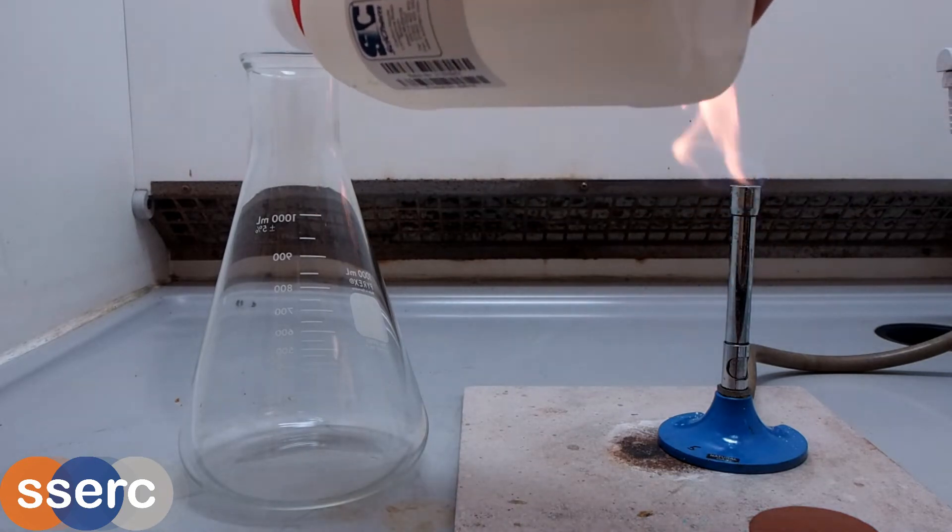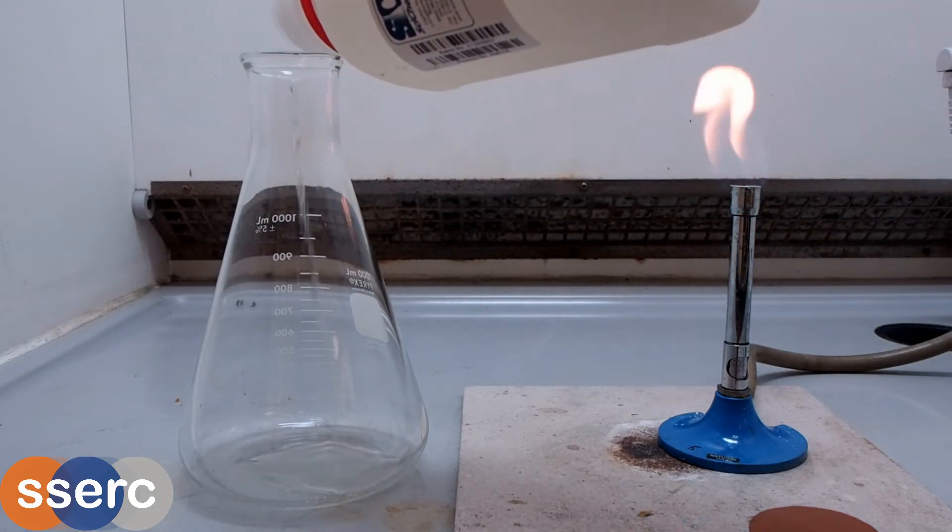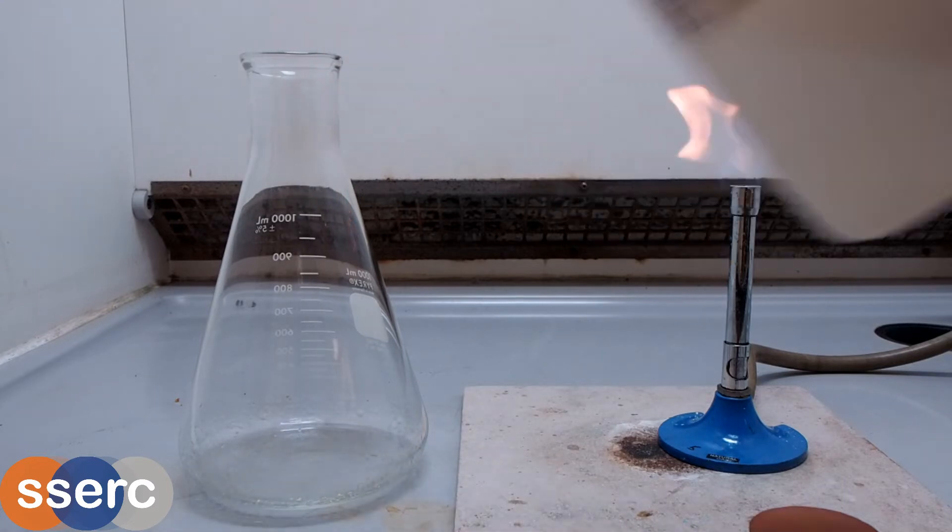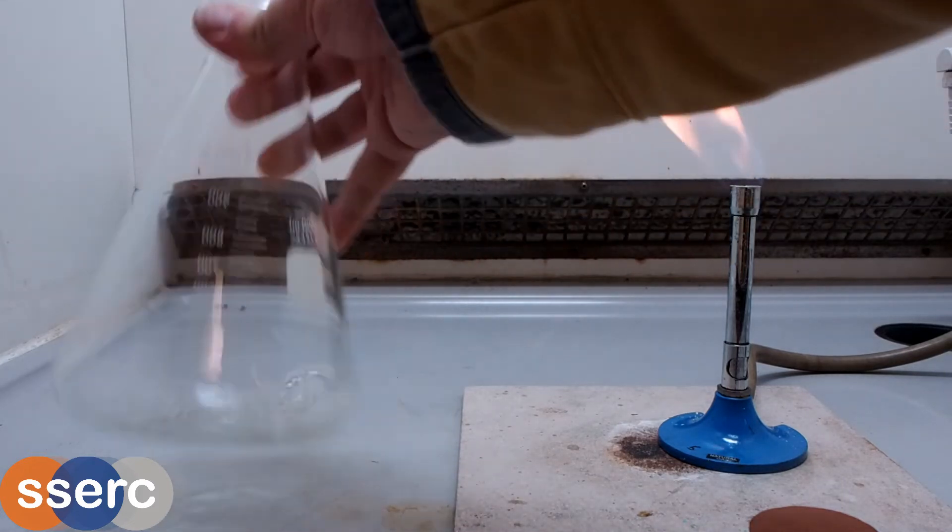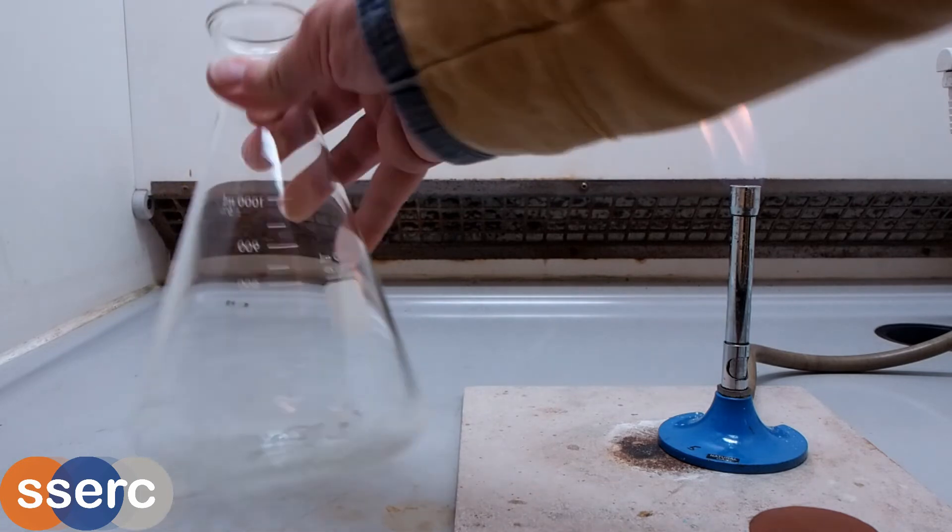For the demonstration, take a flask, as large a one as you can find, and pour a little concentrated ammonia into the bottom. Swirl it around to fill it with fumes of ammonia.